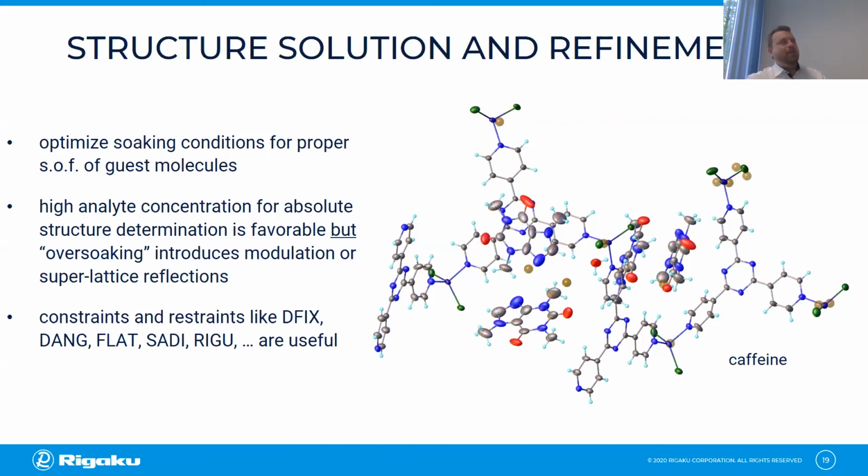If you have too high a methanol concentration, or if you have water inside of this solvent mixture, then probably you will not form the sponge network itself. So if your analyte molecule has many carboxylic acid moieties, for instance, this could be harmful for the framework network, and maybe they cannot be soaked.